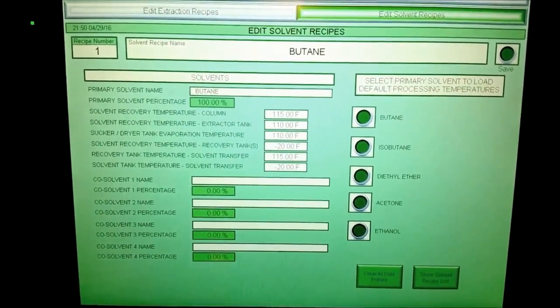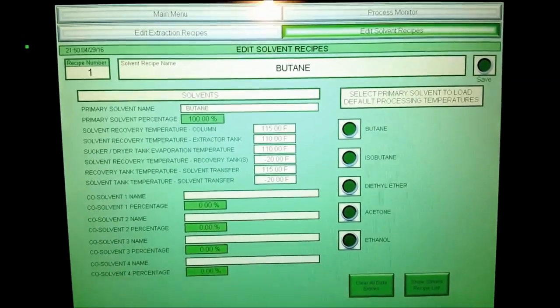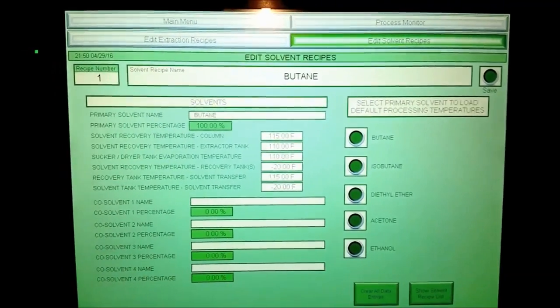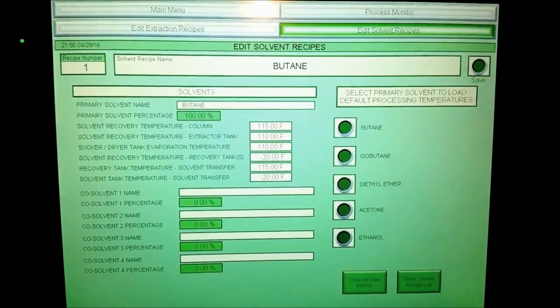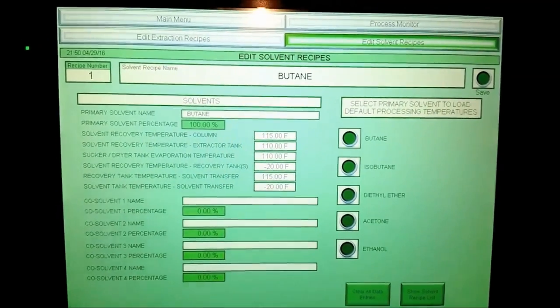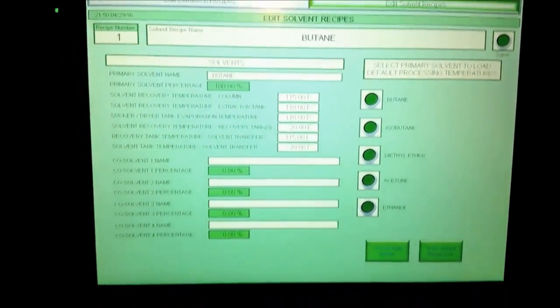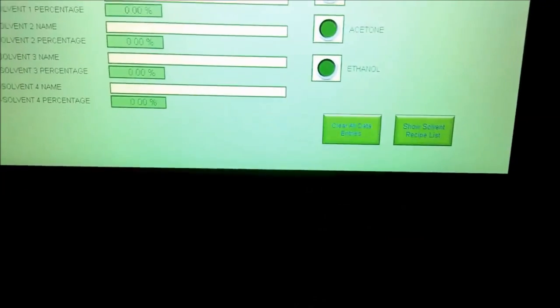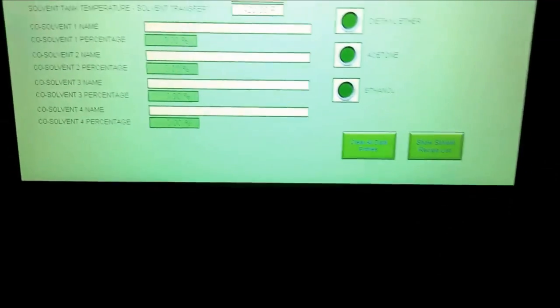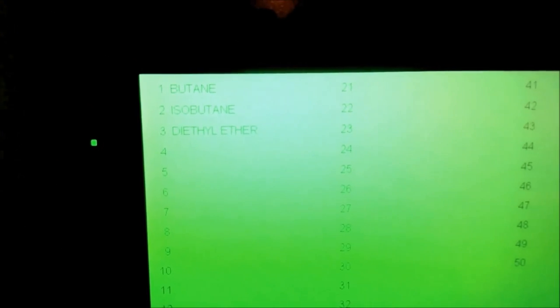This particular extraction we're using butane. You could use isobutane, diethyl ether, dimethyl ether, alcohol, acetone, whatever you need to use. Show your solvent recipe lists. We have three different solvents that we've got programmed in here now.